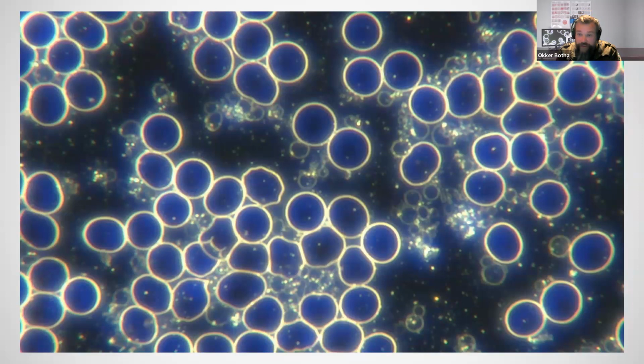So here we have another good dark field image, very, very clear. We can see all those structures between the blood cells very, very clearly. We can very clearly see these small spherical shapes, these little circles all over between the cells. These are all signs of fermentation, so related to Candida. Very important to be able to see this.